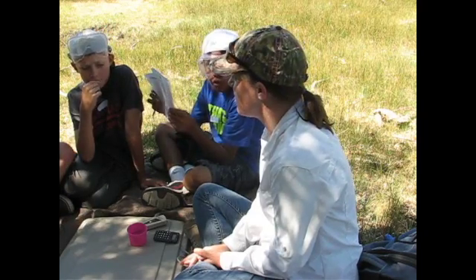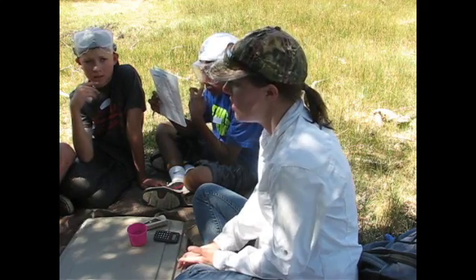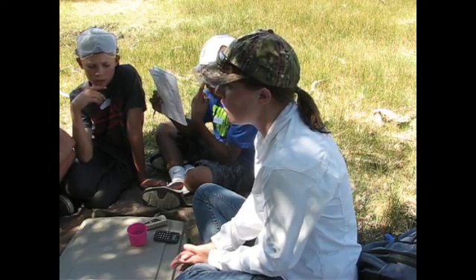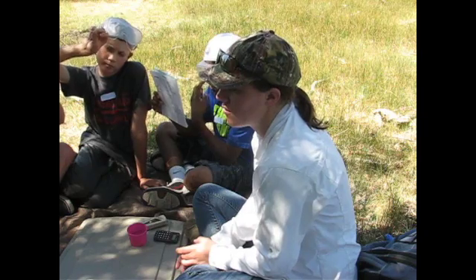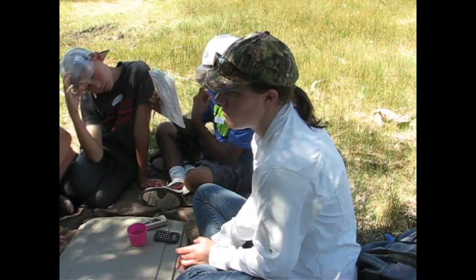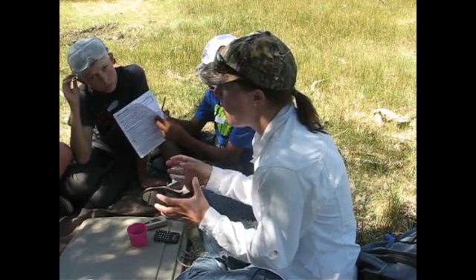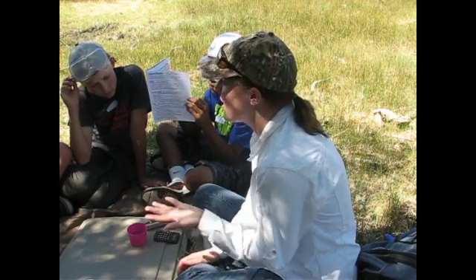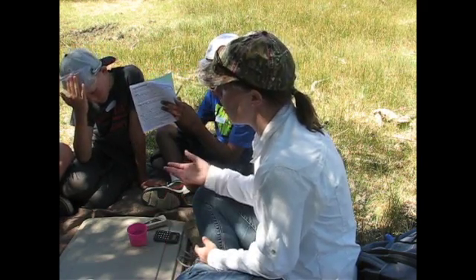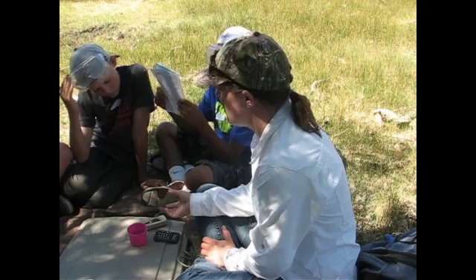This section, we're measuring TDS, which is called total dissolved solids in the water, and we're also measuring hardness. So when I say total dissolved solids, does anybody know what dissolved means? Where it was once like a solid and then its particles just split and mix in with the water. Yeah, so it's any sort of substance that's still solid, but it mixes in so well with the water that you can't see it anymore. An example would be salt or sugar. Anytime you mix those into water really well, you can't see it anymore. So those are the kinds of things we're measuring in the water, the stuff we can't see.